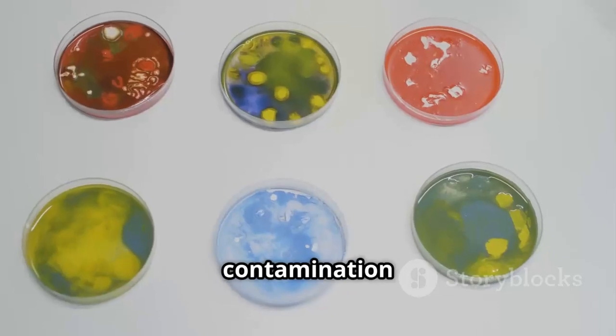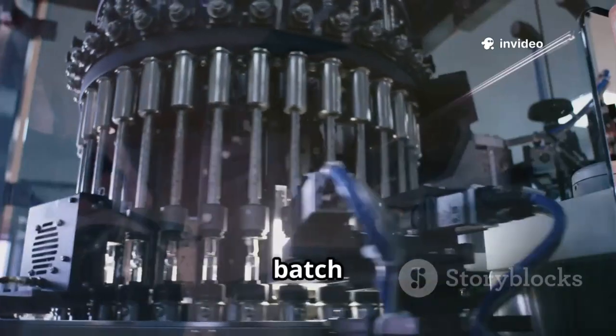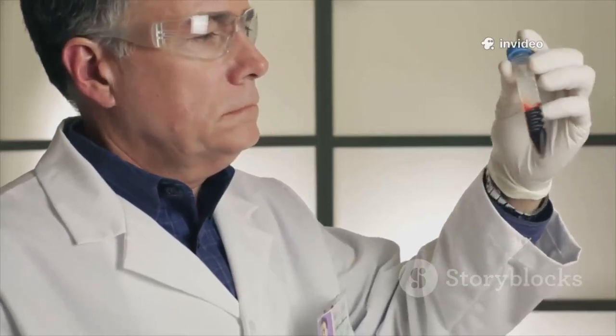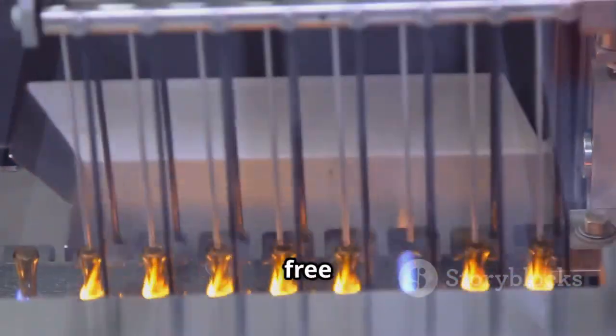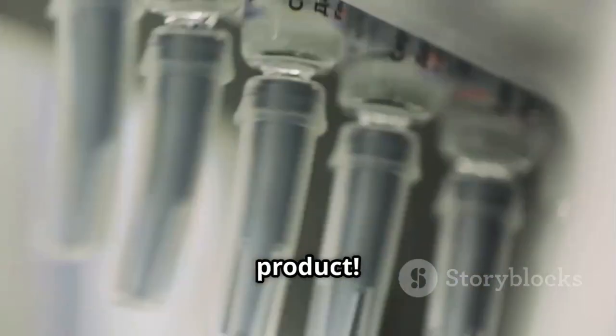What if contamination is found? If even one container shows growth, the entire batch may be rejected unless it is proven to be due to laboratory error. In short, sterility testing safeguards patient safety and ensures pharmaceutical products are free from harmful microbes. Sterile product equals safe product.